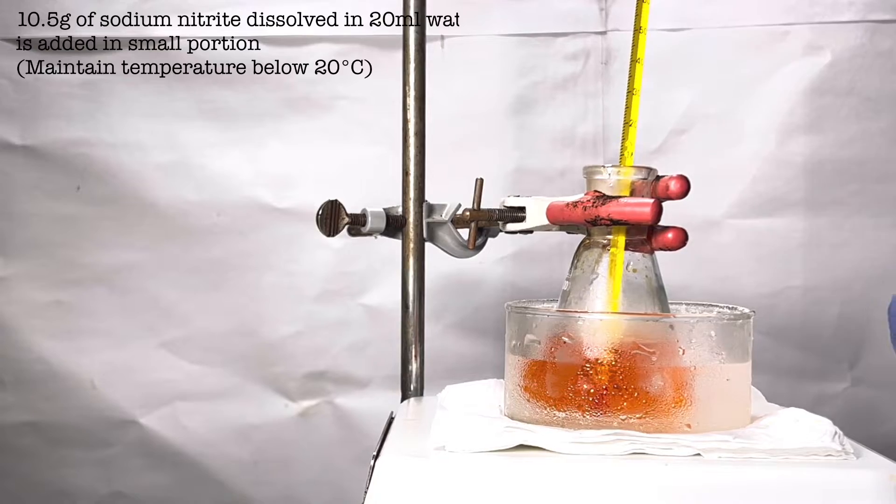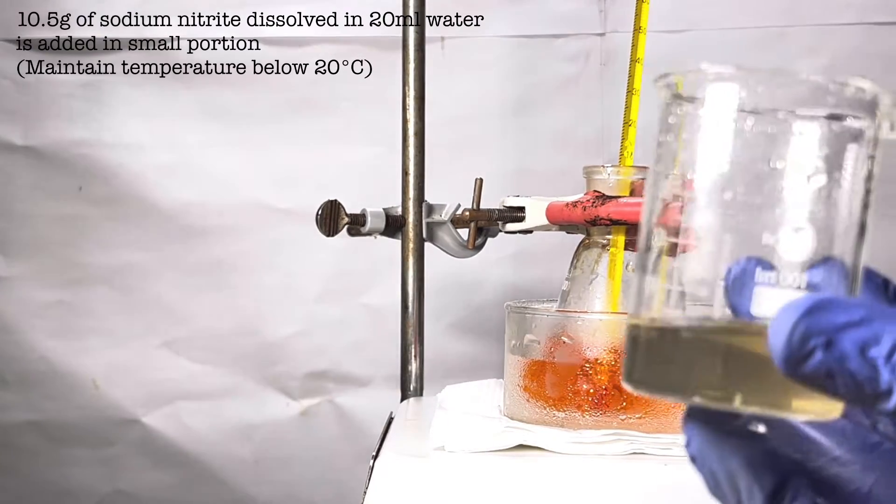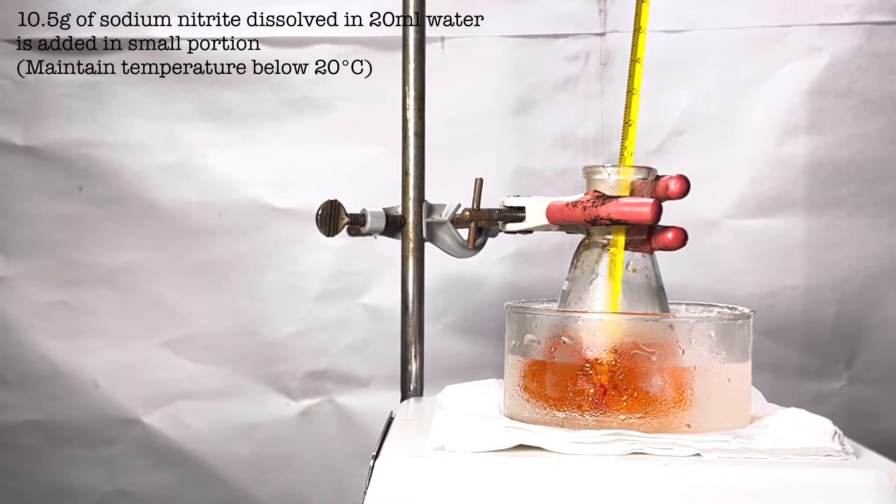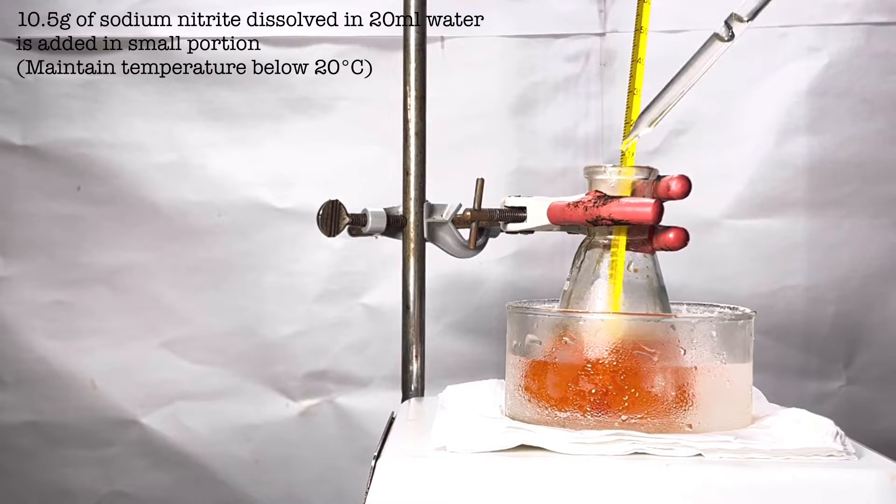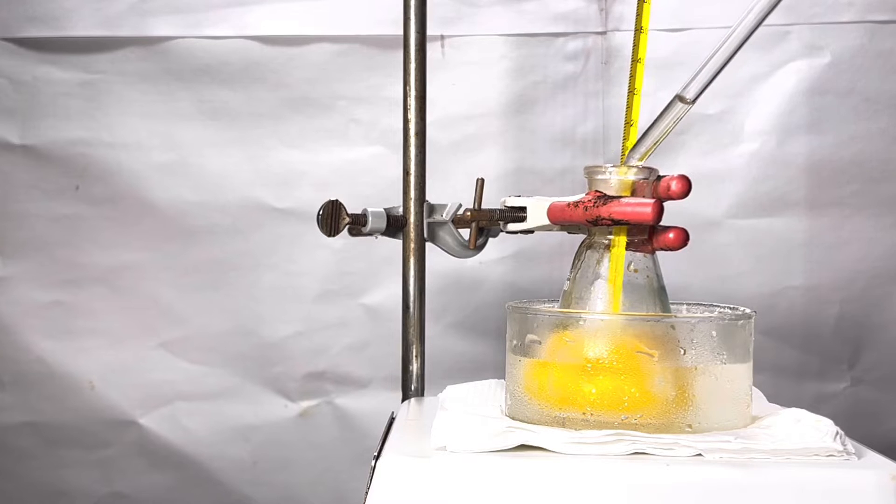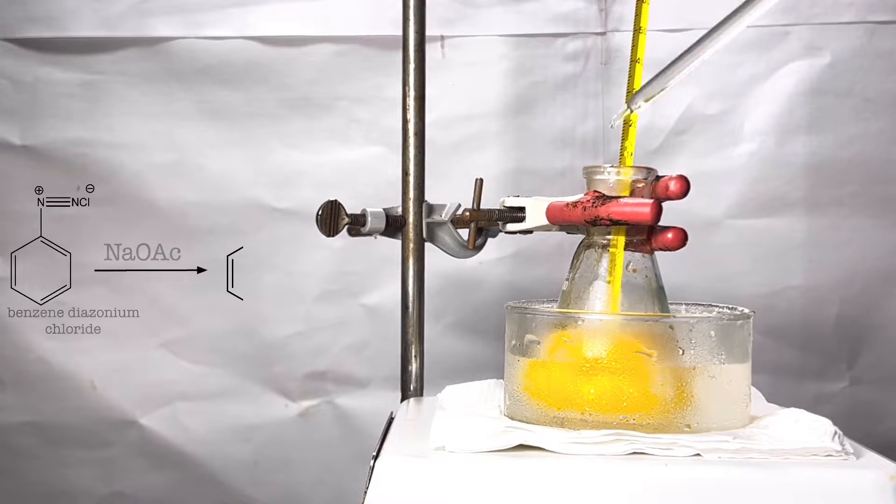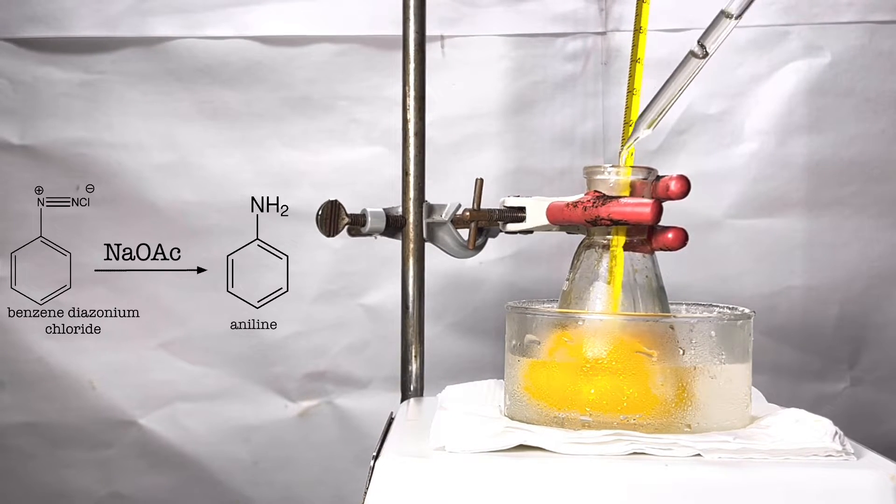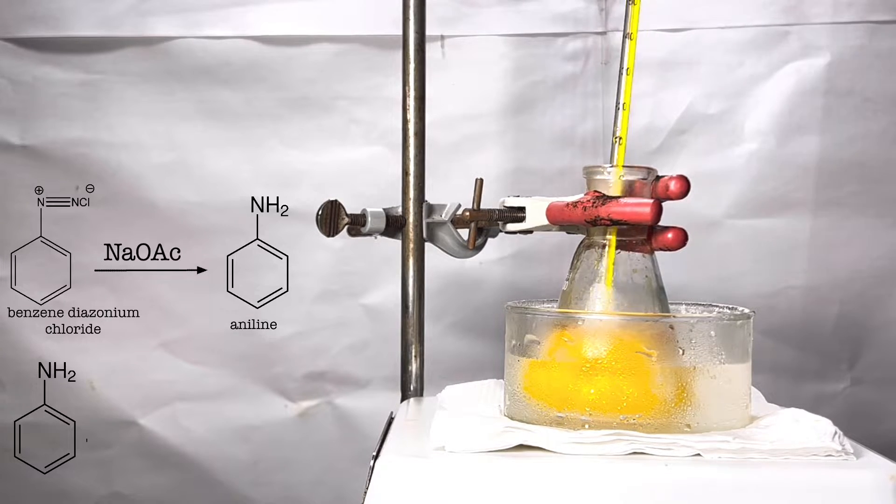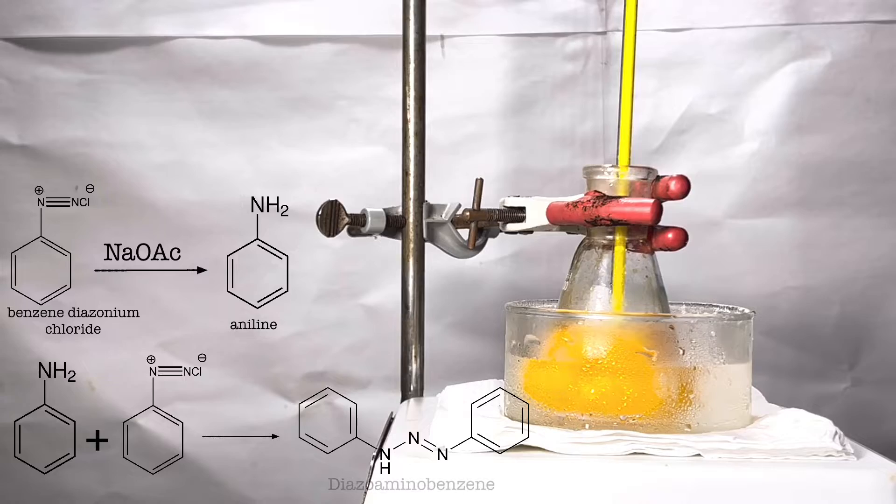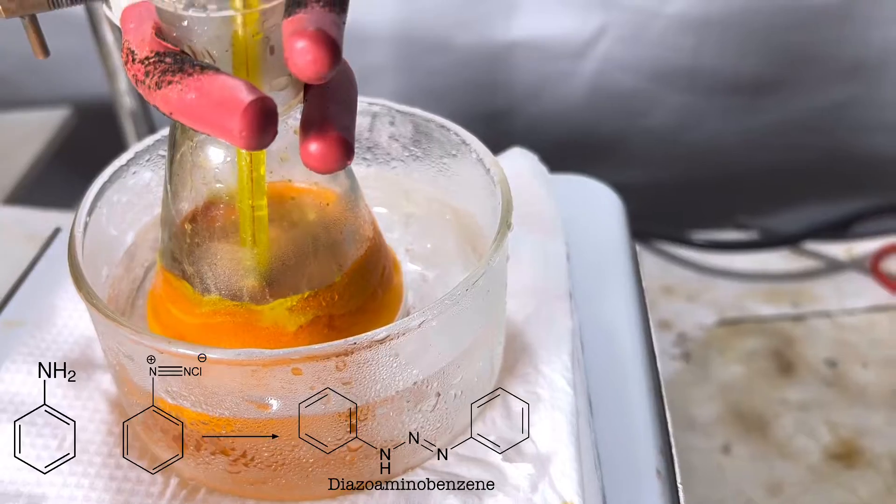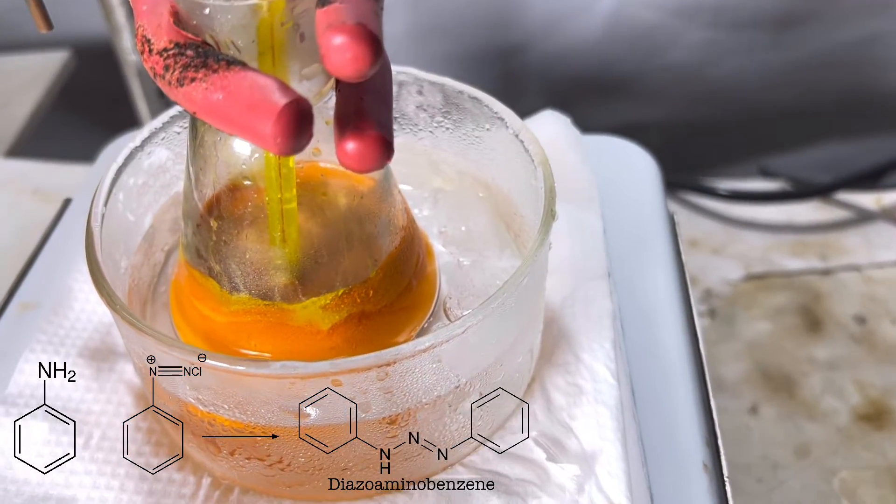Add a solution of chilled sodium acetate containing 10.5 grams of sodium acetate in 20 ml of water. This should be also added slowly using a glass pipette. This causes the precipitation of the product diazoaminobenzene. Excess of acid that is 0.5 to 1 equivalent to the diazonium salt maintains the proper condition of acidity required to stabilize the diazonium salt solution.